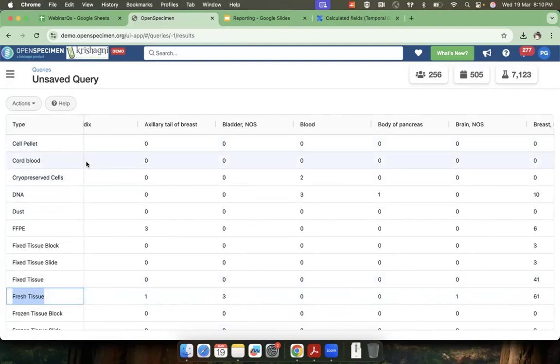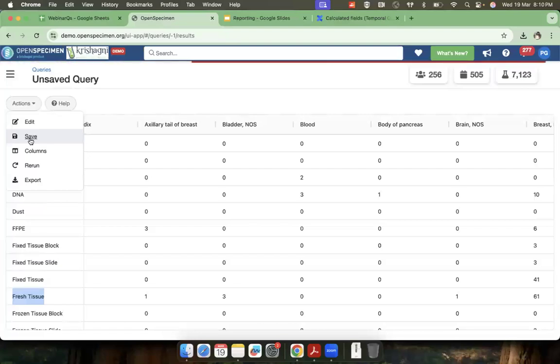You might want by gender and race, how many patients are there. So you can create such pivot tables. And again, these pivot tables can also be saved. They can be scheduled to run on a monthly basis, quarterly basis. So generally these count-based summary reports, you might want to generate and send to your stakeholders on a monthly basis. So these can be saved and scheduled so that they automatically run.